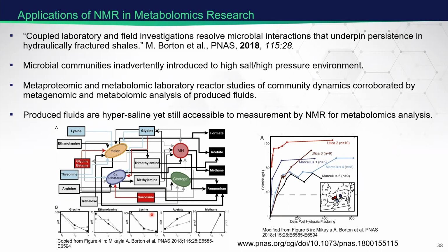One of the reasons it was so advantageous to use NMR is that these hydraulically fractured shales, these produced fluids, are extremely saline, they're hypersaline. You can imagine cleanup being quite a mess, but we have salt tolerant cold probes, and we were able to measure these metabolites and help map these out. So NMR is highly tolerant of quite a wide range of conditions.